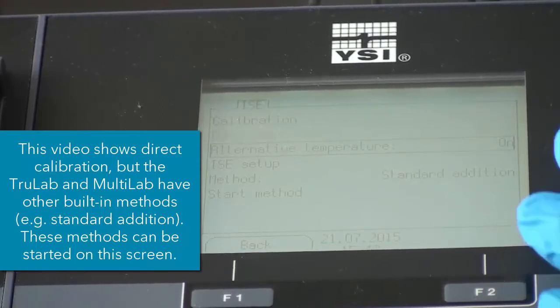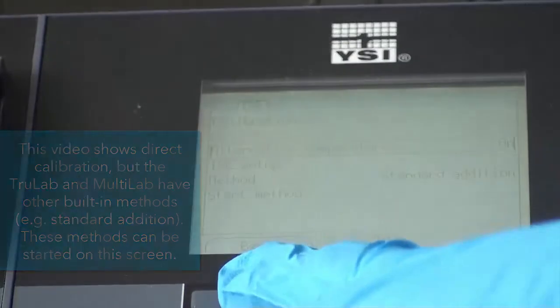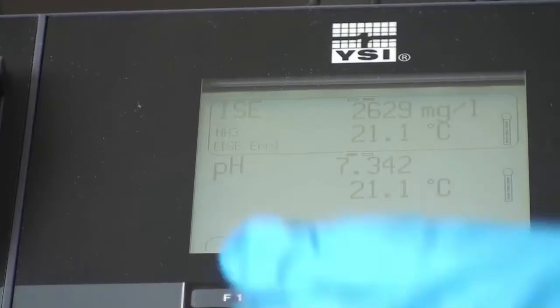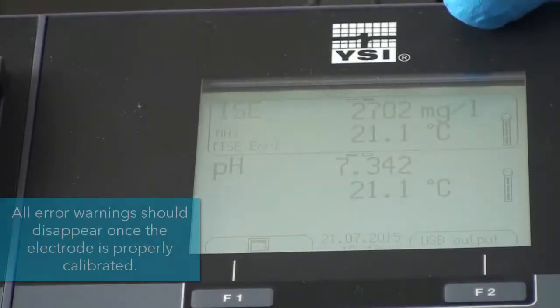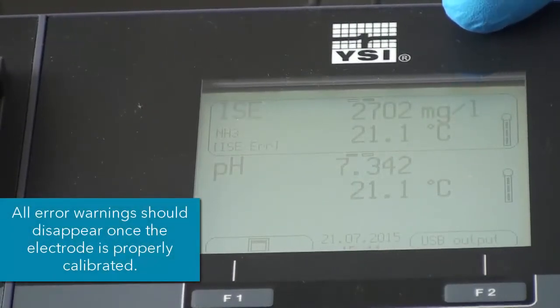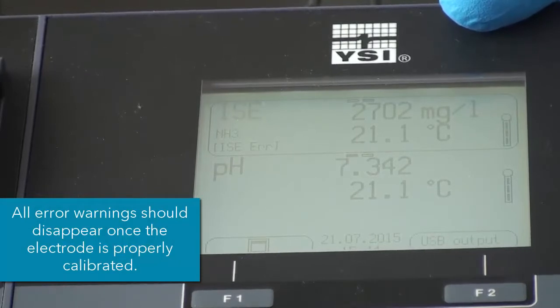So with that, I have this alternative temperature set to on, so we will use that alternative temperature. So once you have done that, don't be alarmed if you see any error warnings, and those will go away once you calibrate it.